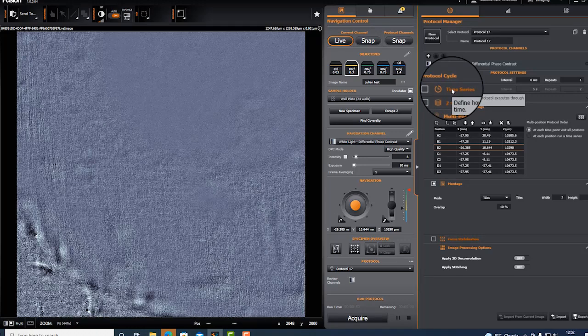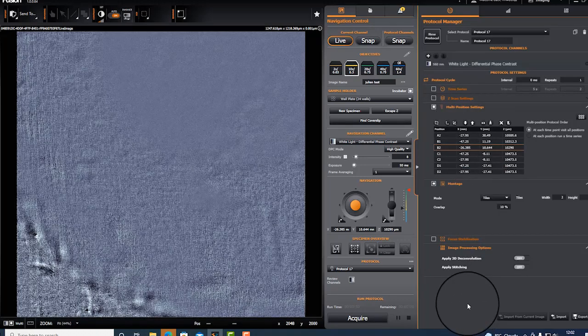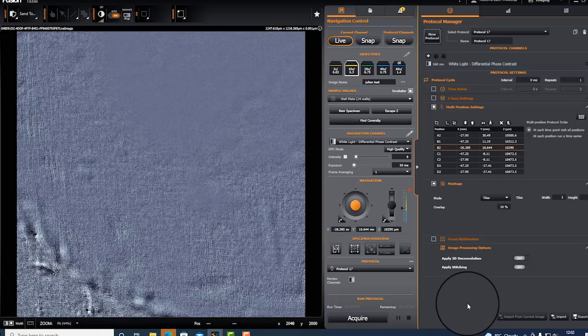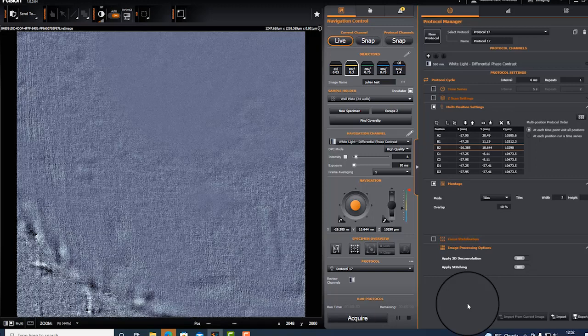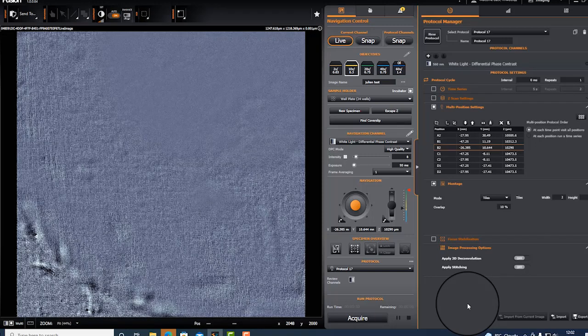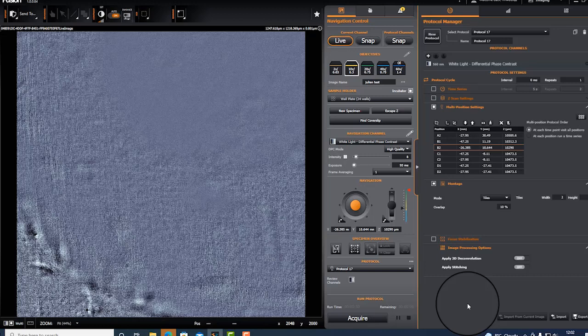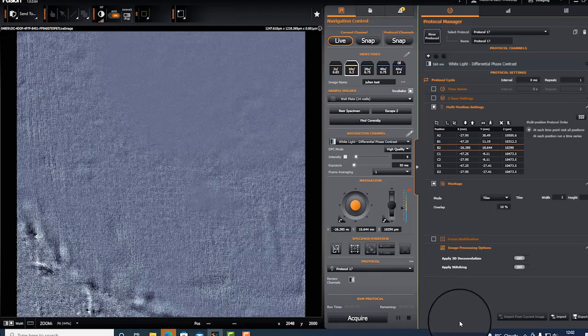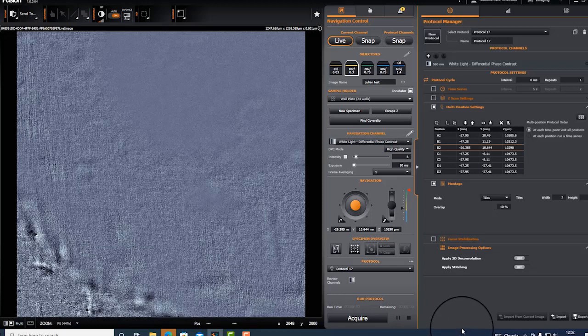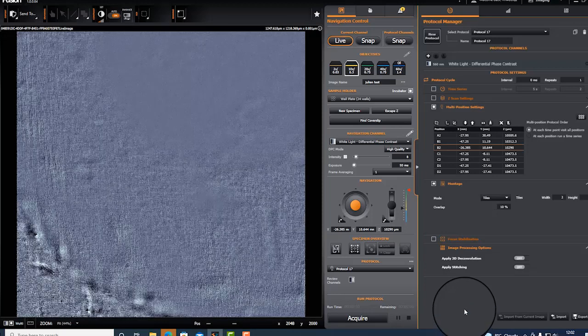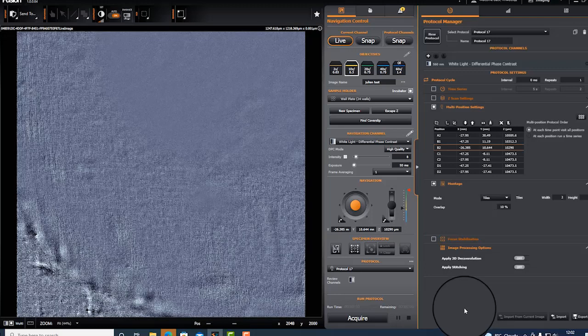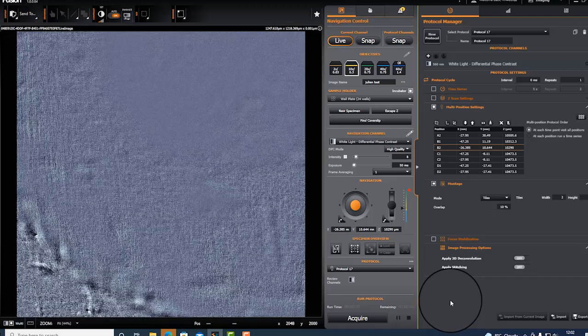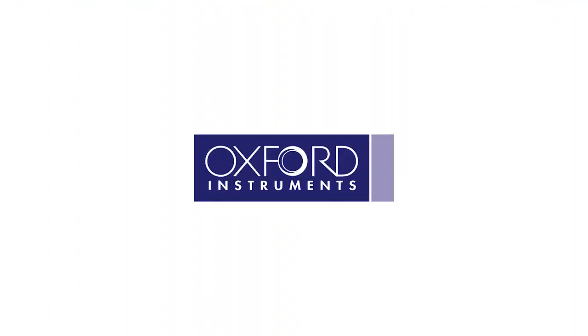You can also perform a time series. Please note that if you need to adjust all the positions and they are all adjusted by the same x,y or x,y,z offset, you can do it by applying the offset in the table. This is a quick overview of how to perform a multi-well acquisition using BC43. Thank you very much for listening.